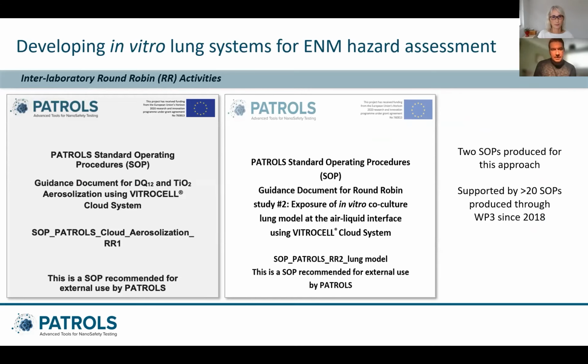Yeah, it's a fantastic collaboration by all partners in this interlaboratory round robin activity that was led by Hedvig and Rob at RIVM. It actually included not just patrol partners, but what we refer to as non-patrol partners across Europe. And it was a fantastic interaction. Prior to any data collection, we were able to create two very nice SOPs that went through rounds and rounds of iterations, and I think still could now go through rounds of iterations to get the absolute finite detail, which is what I'm sure you can appreciate is key towards experimental harmony.